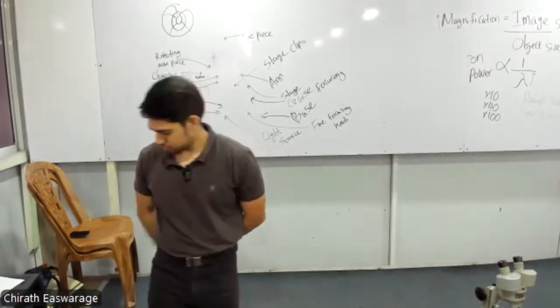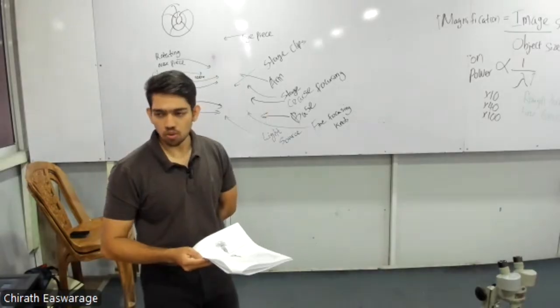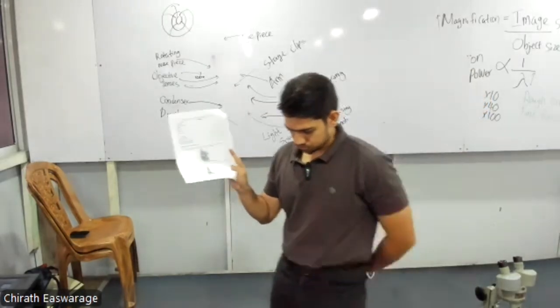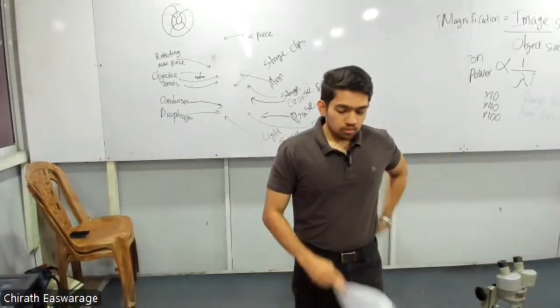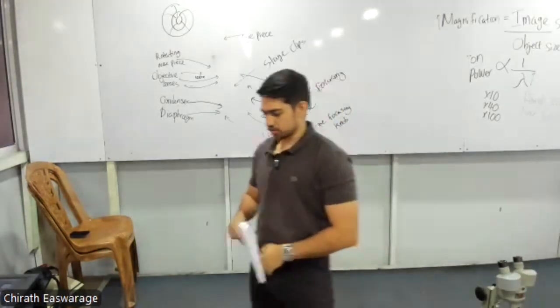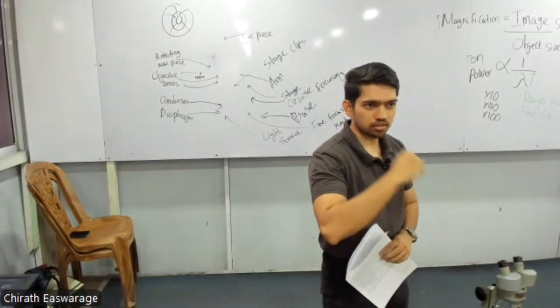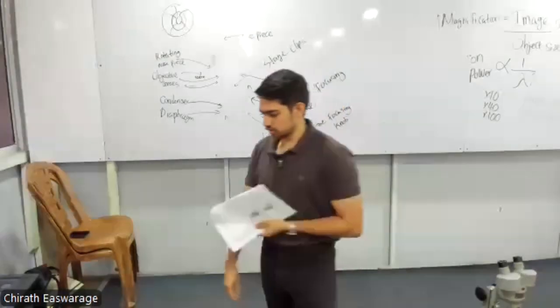This first thing, that is the main switch, that is not that necessary, right? Used to switch on or off the light source. Just write it down: used to switch on or off the light source for main switch. Light intensity knob is again a bit unnecessary, but you can say adjust the light intensity. Have you seen, you can make it bright and low, no? Those kind of filament bulbs that you can control. Adjust the light intensity.